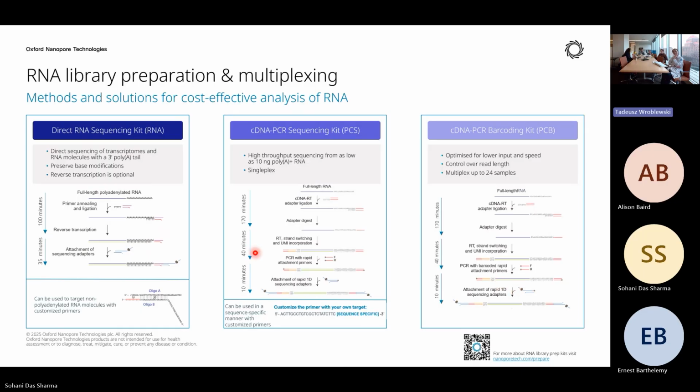Suppose you are looking at microRNAs. I think Terry might have asked you this yesterday and I was not paying attention. The microRNAs are very small, and they are not polyadenylated. So can we polyadenylate them and then use direct RNA sequencing, or is it too small?